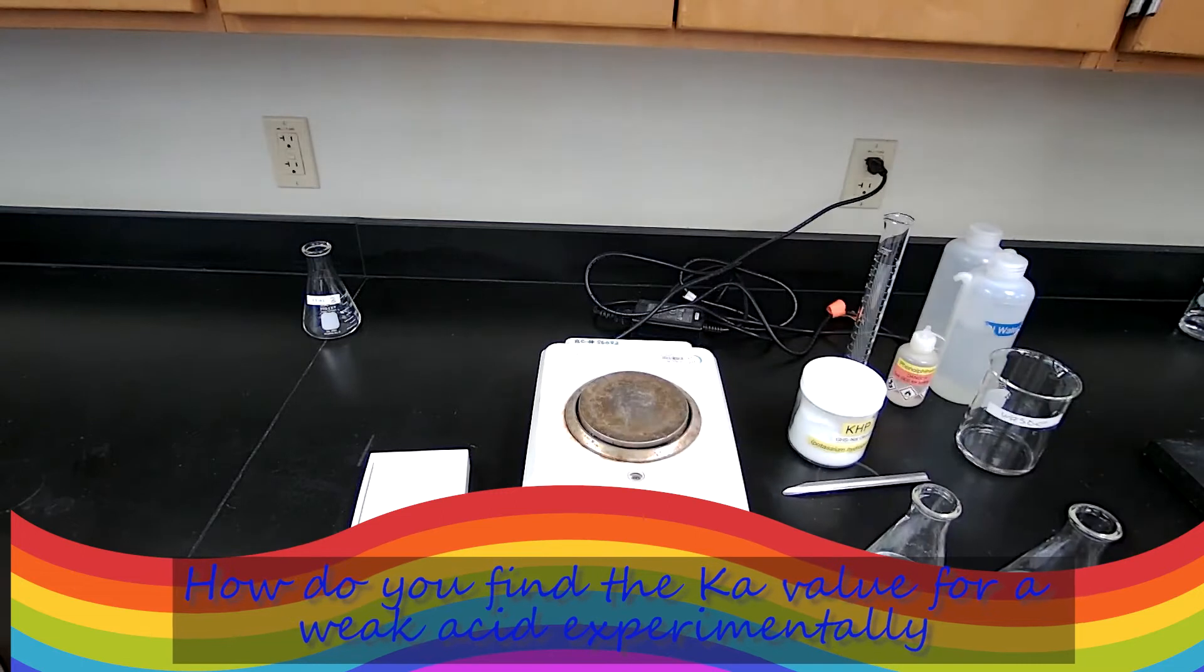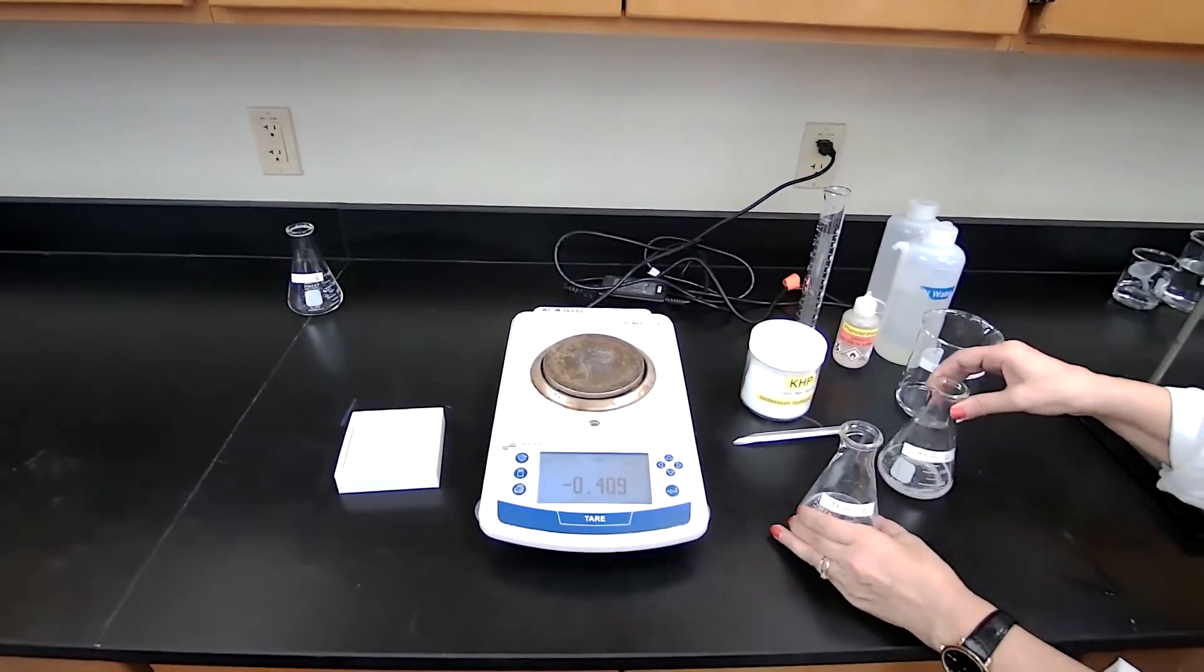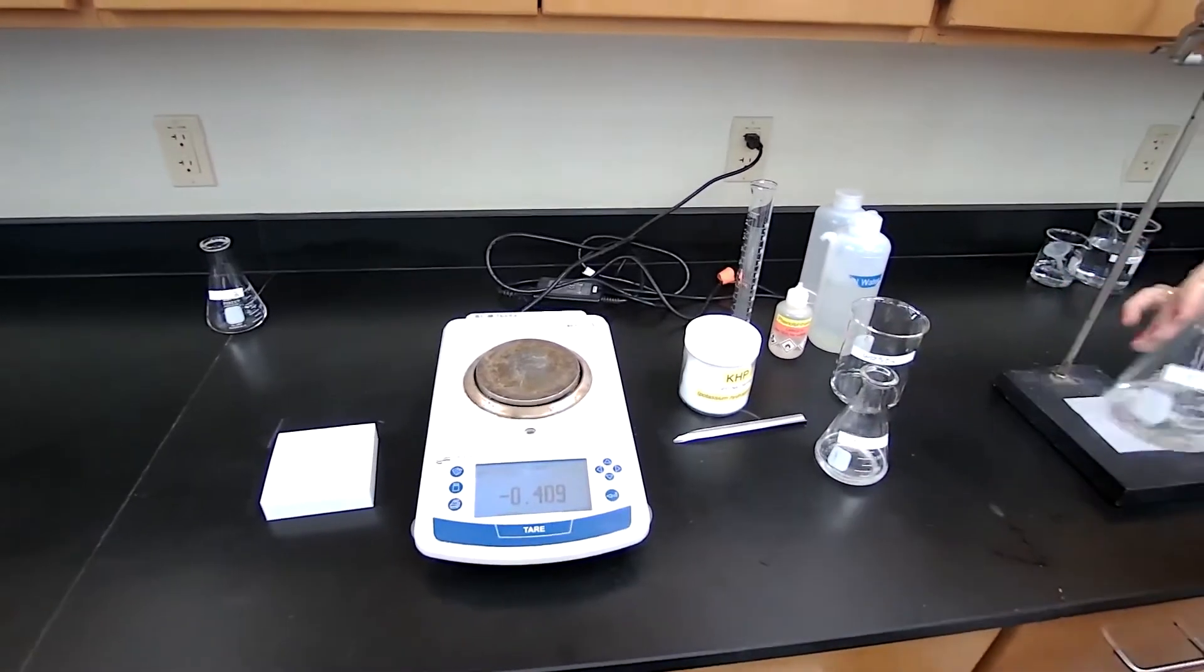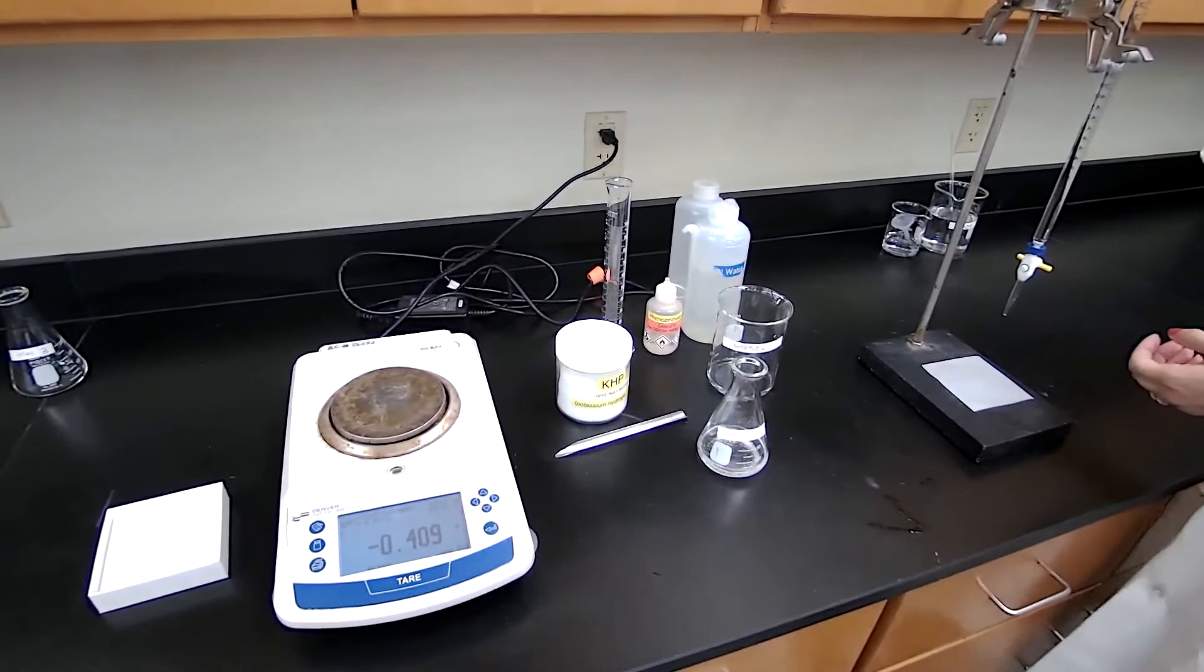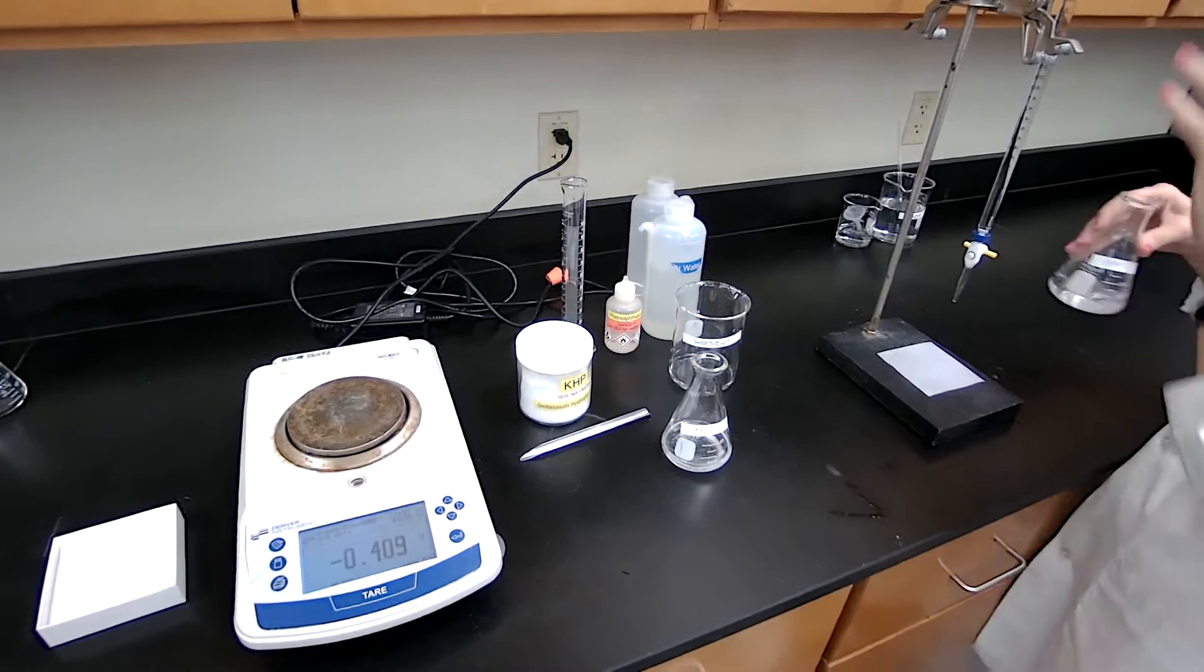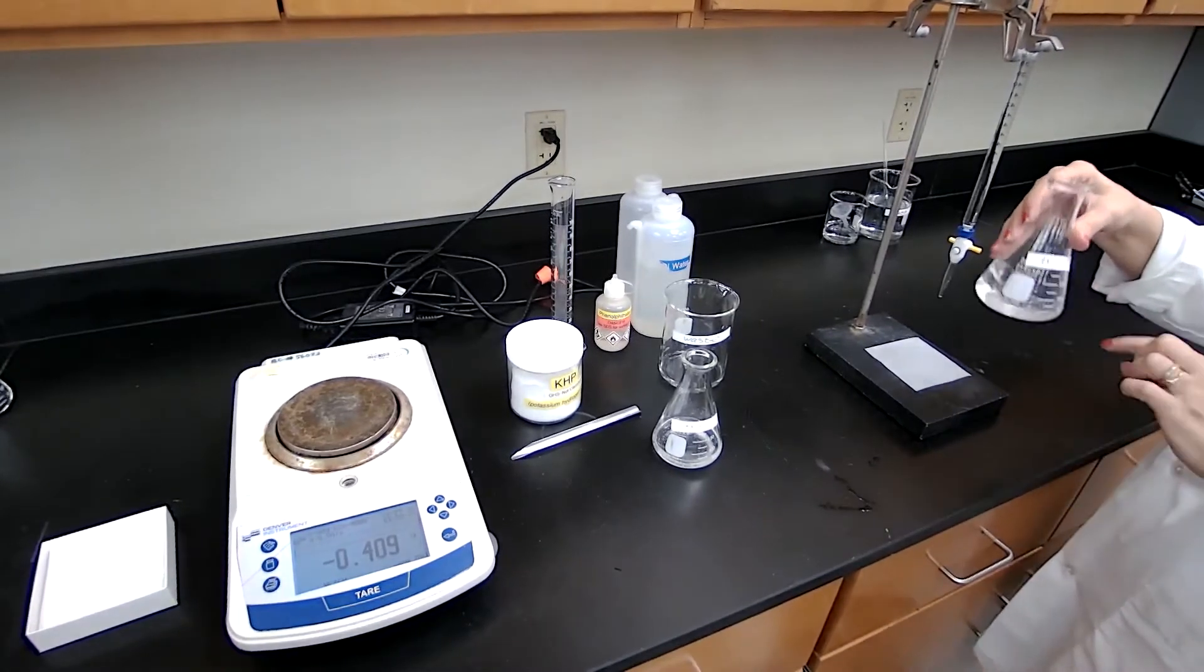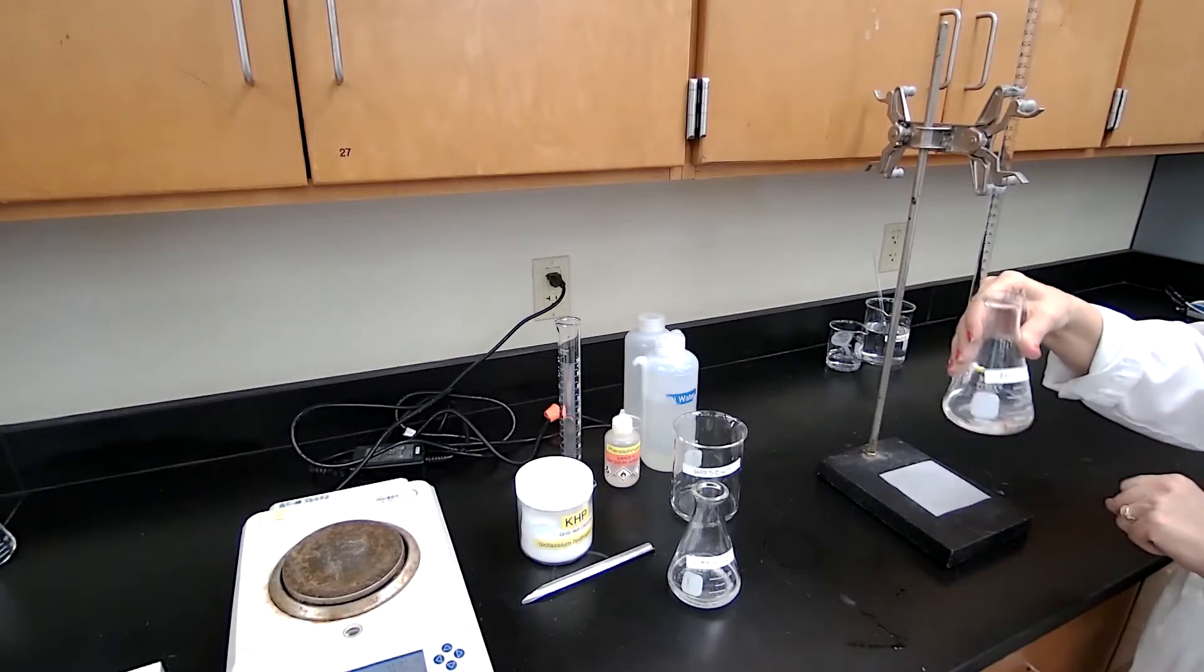The white background is going to help me to see the color change. I can start the titration for the first trial by adding the solution of sodium hydroxide, which I prepared my burette with.